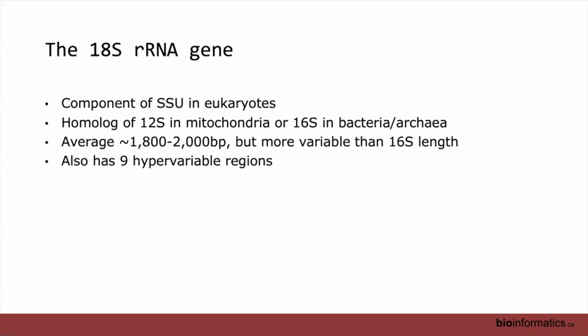You will find, though, that where in 16S sequencing, you can typically trim everything to a similar length, you have a lot more variation in your 18S rRNA gene. So when you're looking to trim to 300 to 500 base pairs or something, that's usually what we can sequence effectively with short read sequencing. In 16S, everything will end up more or less the same length, but that's not the case for something like 18S or ITS. So it's just worth keeping in mind so that you don't panic that something's gone really wrong with your data processing when it's just an artifact of the different gene that you're using.